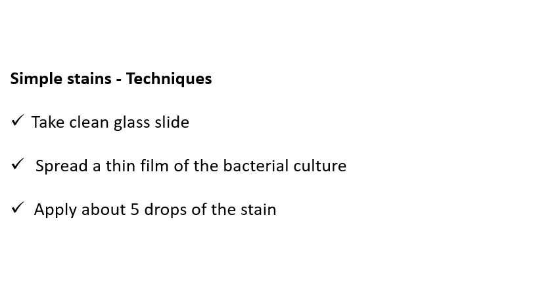We can use different stains for this purpose. When you use separate stains, each stain's time duration is different. For example, if you use methylene blue, you have to maintain 50 to 120 seconds.